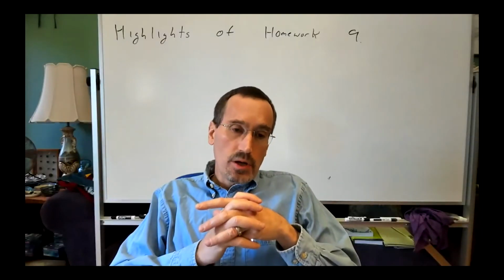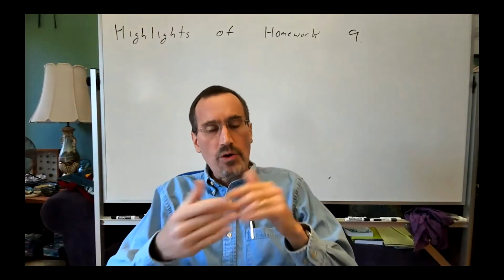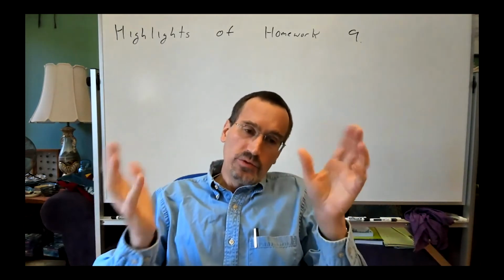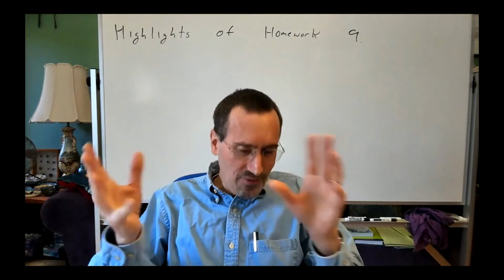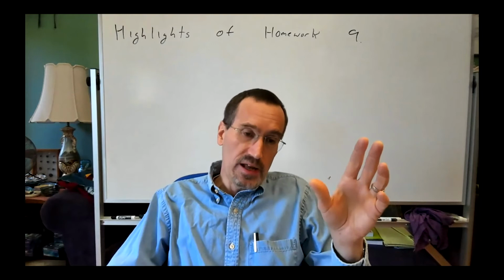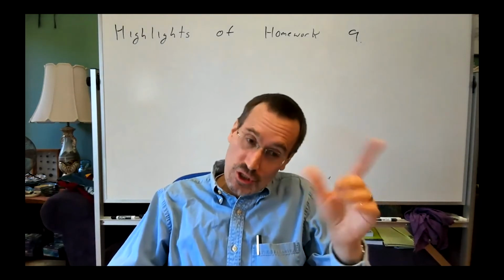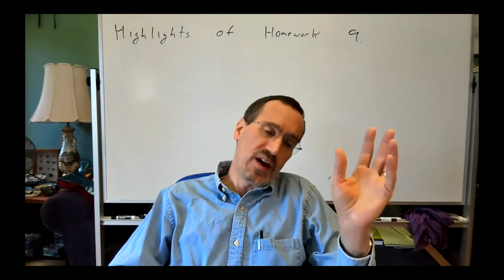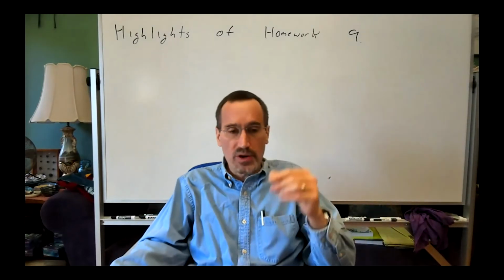My one clarification was peak 24, you picked that out as an alpha proton? Yeah. Okay, thank you. So basically, for amino acids and peptides, the region around 4 to 5 ppm is typically the alpha protons. 4-ish to 5 point something, 5.2, 5.3 is typically the alpha protons.